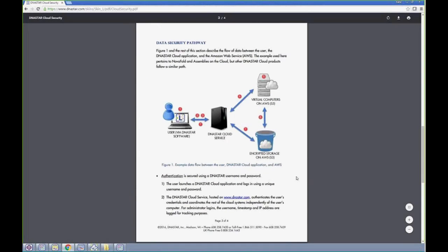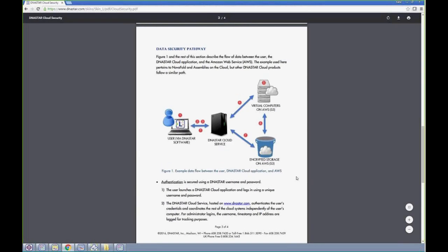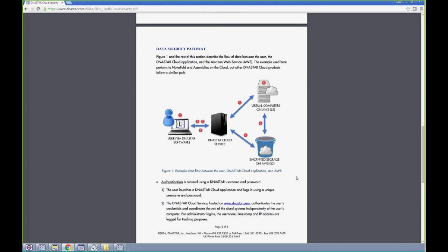Okay, that was really helpful, Katie. And another question is about how long data is stored on the cloud for. Is it up there for years or for a few days or what? So our policy is we keep the data on your Cloud Data Drive account for 1 year after your license expires. So most people, they're going to do their assemblies and download the results.